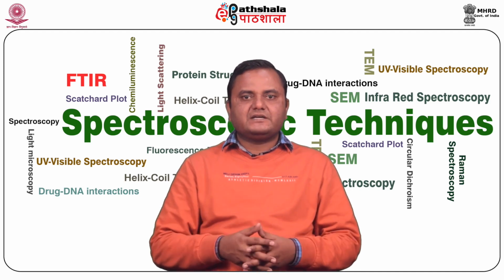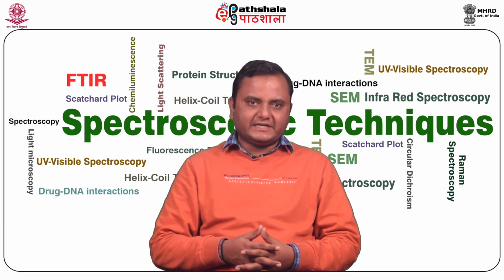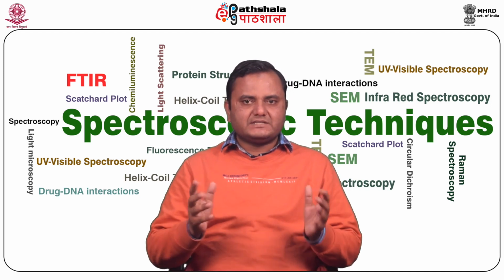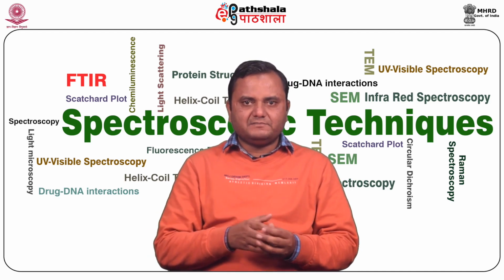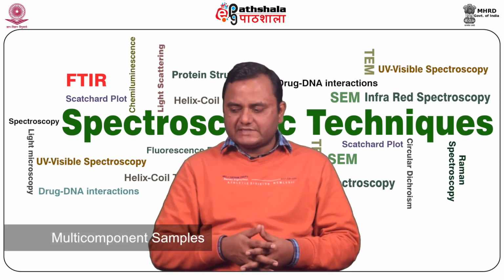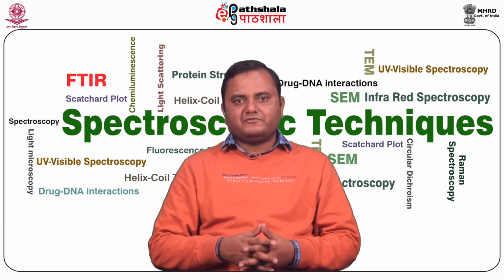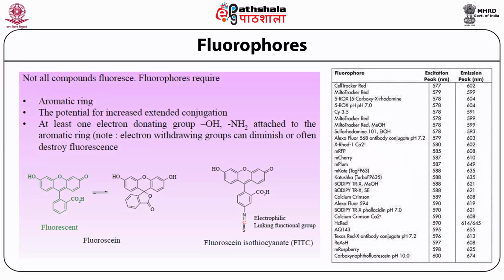So where kf is the rate of fluorescence and kd is the rate of radiationless deactivation, and the fluorescence lifetime measurement is an available technique in the analysis of multi-component samples containing analytes with overlapping fluorescence bands. We discuss the different types of fluorophores that are used.